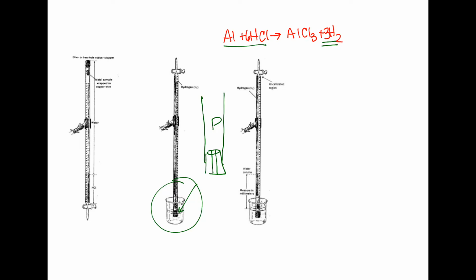And so this beaker down here has some water in it, and that water is just so that we can equilibrate the pressures without letting extra gas go into our burette. We are setting up something kind of like we talked about in class, something like a manometer. A manometer allows us to equilibrate two pressures or relate two pressures to each other without letting the gases touch. And that's what we're doing with our little beaker full of water here.